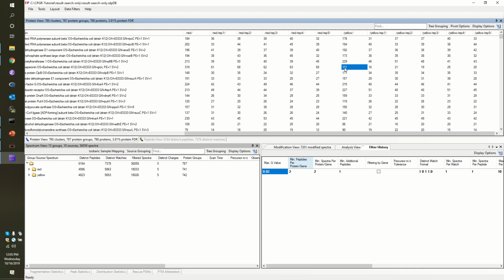Okay, so a lot of the time when you're doing a biological experiment in proteomics, you're not just seeing what's there. You can do that. There are times when that kind of experiment is appropriate. Generally, people are doing proteomics because they're going to compare cohorts. And for that, spectral count tables like this are your bread and butter.